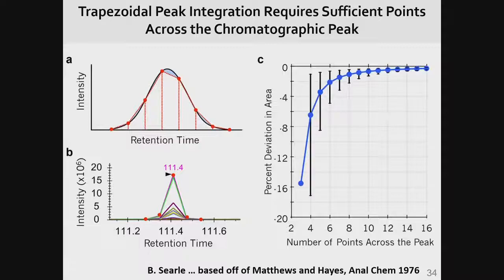And in Skyline, it still does all the quantitative computation from the unsmoothed data. We just use the smoothing to help pick the peaks, et cetera. Meaning the computation that goes in is without smoothing? That's correct. That should be done anyway, ideally.